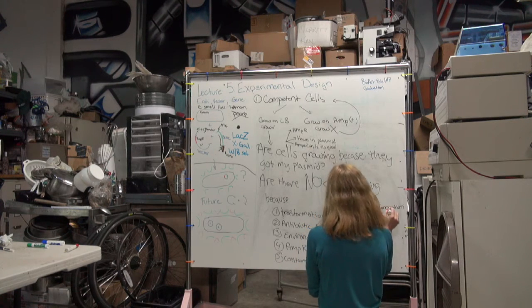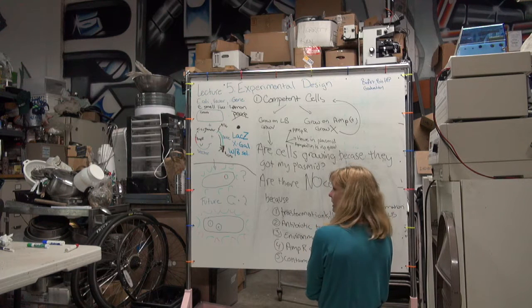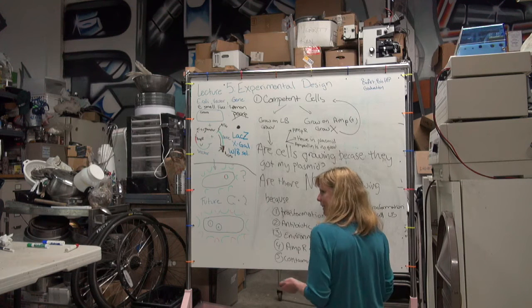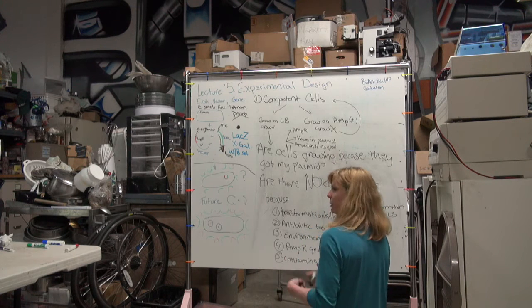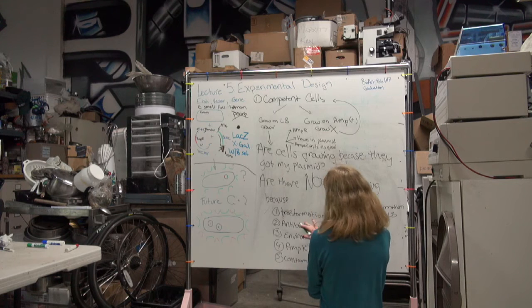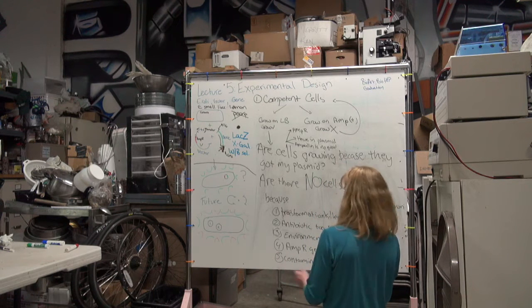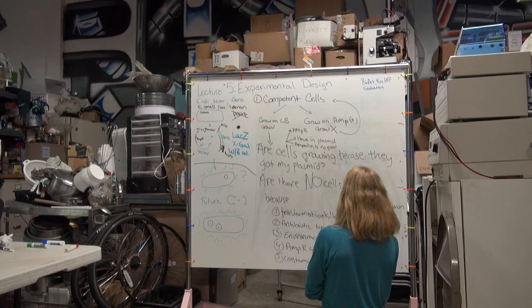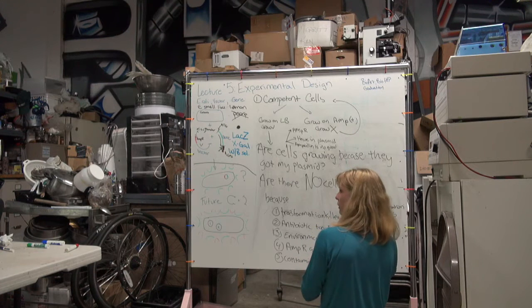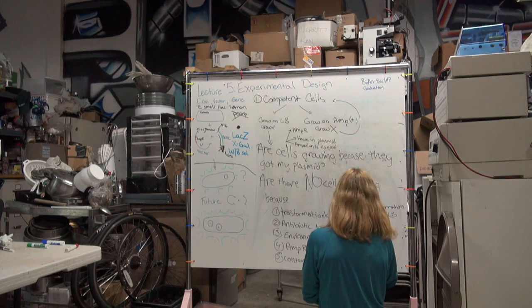Because if this control transformation doesn't work and I don't have the competent cells tested, it takes another day, right? So you just do it at the same time, just to double check. I know it seems redundant, but redundancy is good. So that's the transformation killed it. That's a possibility. Antibiotic too strong, right? So a control transformation can answer that question. But we're testing for two things, so just keep that in mind.